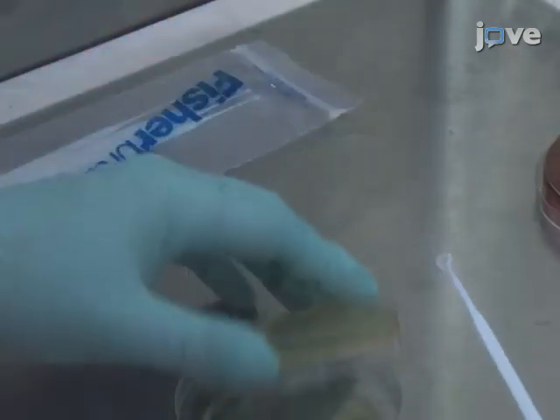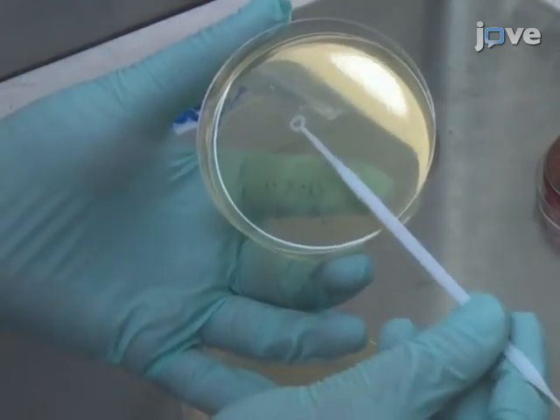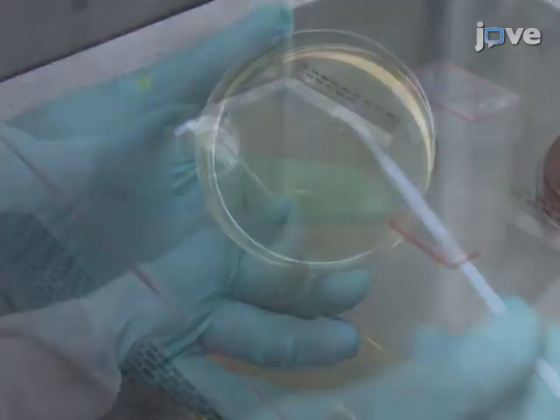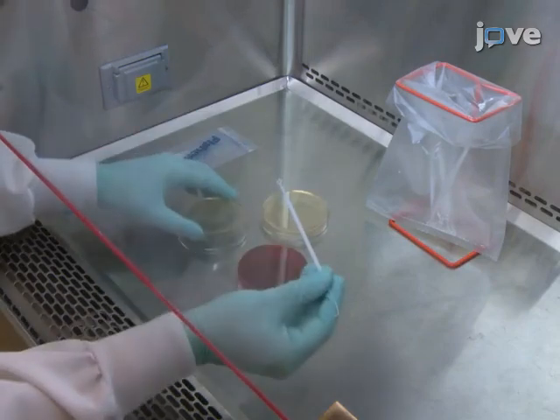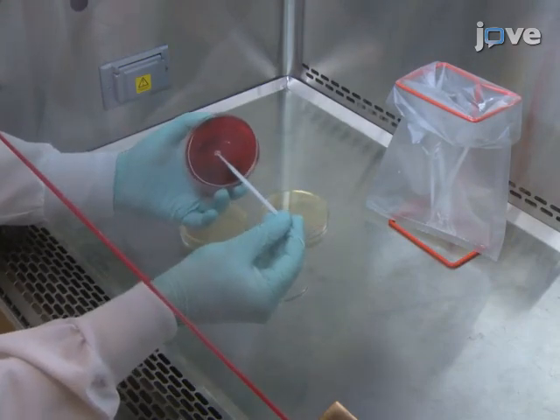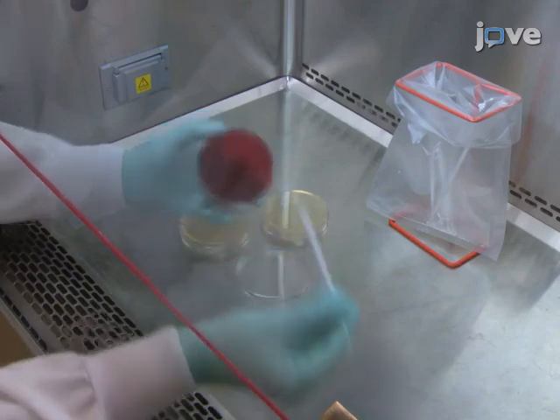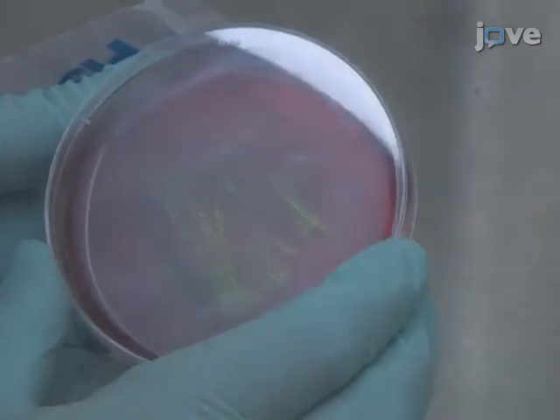The next day, reculture the organisms on a new plate for a 24-hour 35 degrees Celsius incubation. Then, streak a colony onto a Levine eosin methylene blue agar plate for another 24 hours at 35 degrees Celsius. Cultures that turn a reflective metallic green are positive for E. coli.